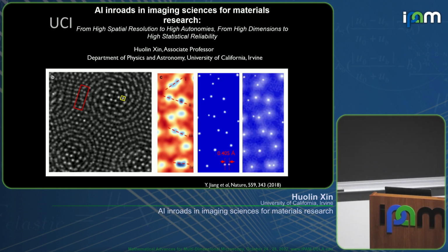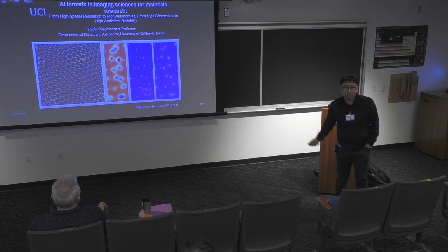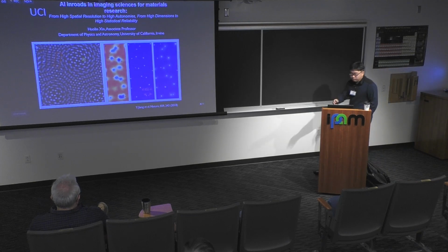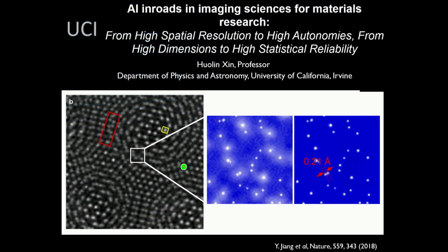So the thing is, I want to show that with the super resolution neural network that we have created, bam, the resolution comes out, right? And the contrast is so vivid and confident. What's more interesting is that there's a blob of intensity down here. This is our super resolved image overlaid on top of that blob of intensity. Actually, we found a 0.21 angstrom dumbbell that wasn't reported in that paper.